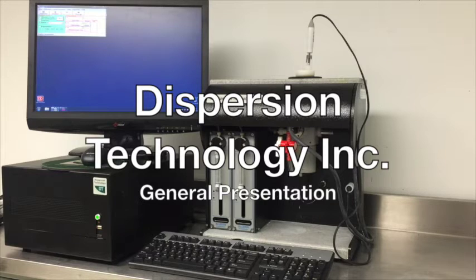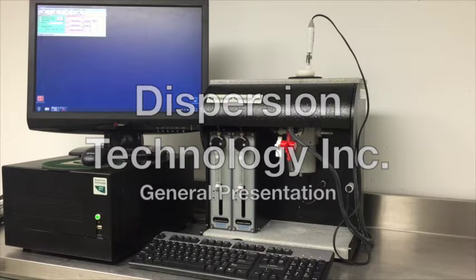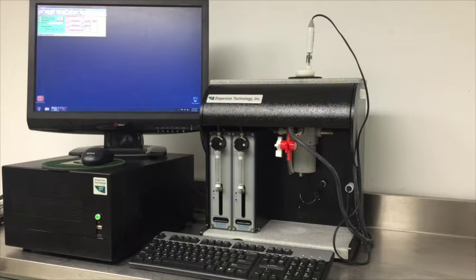This video presents the general features of the hardware and software, as well as sample handling procedures for the Dispersion Technology instruments. These instruments are designed for characterizing concentrated dispersions and emulsions without the need for dilution. There is also an option for characterizing some properties of porous materials.